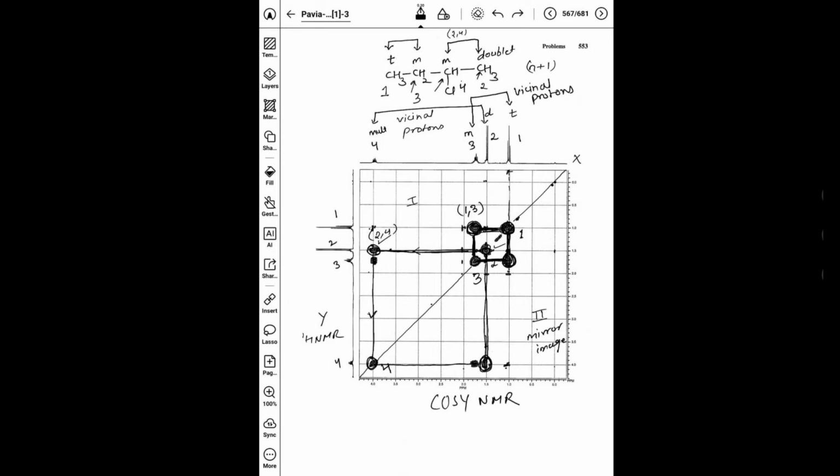So this is another cross peak. Now let's look at the third diagonal peak. This is the third one. Draw the horizontal line and you can see that this is connecting to this 3. Yes, 3. And then draw the vertical line. It is connecting to here.